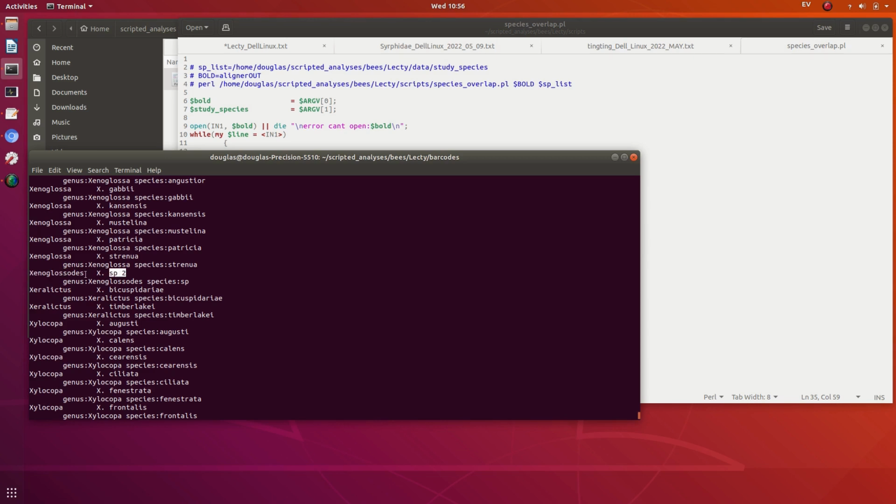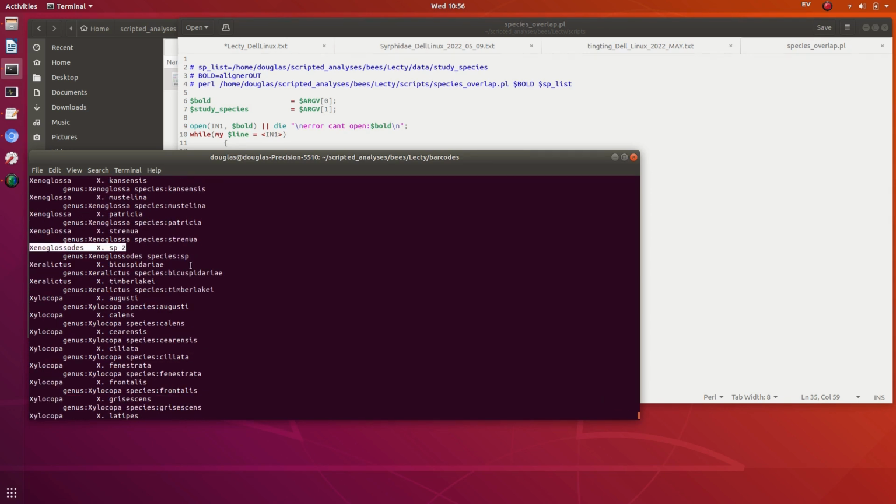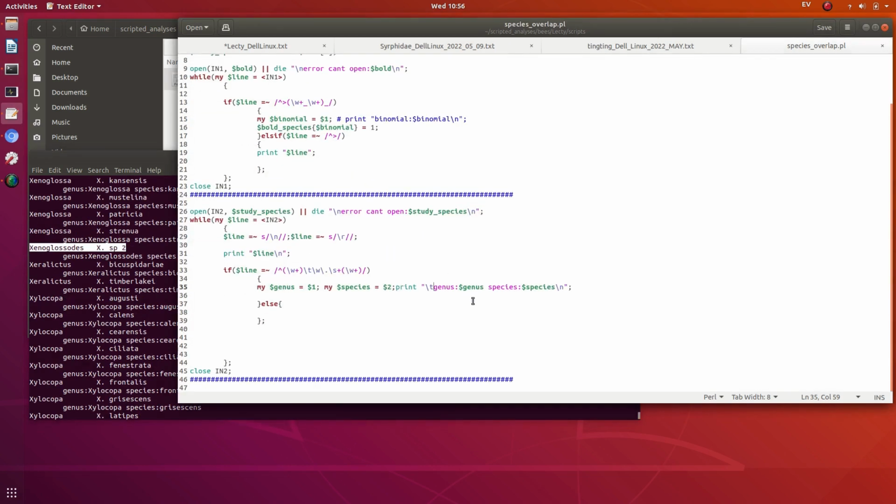And at this stage, we'll probably just have to ignore these. So there might be various ways this is written.